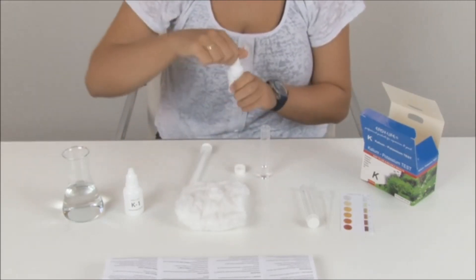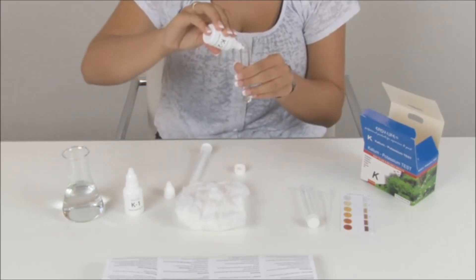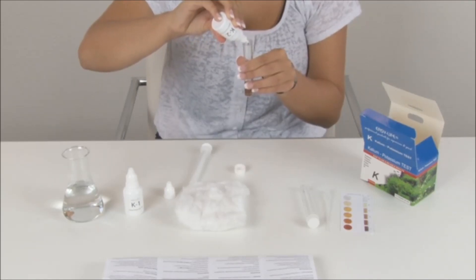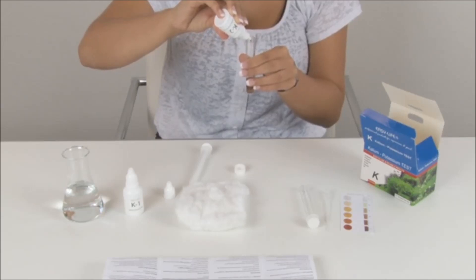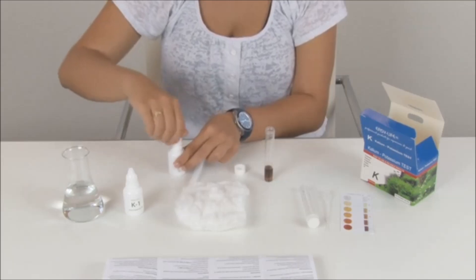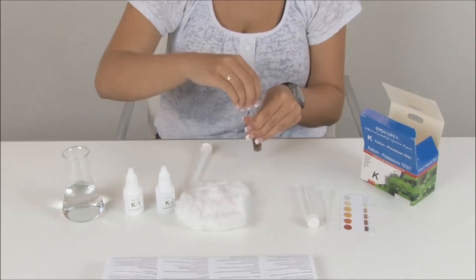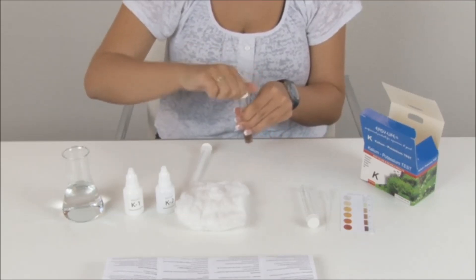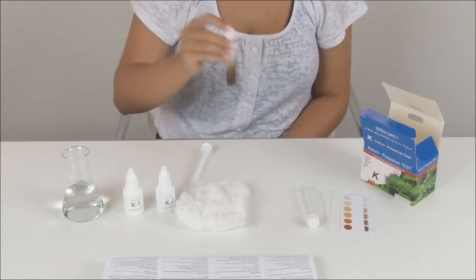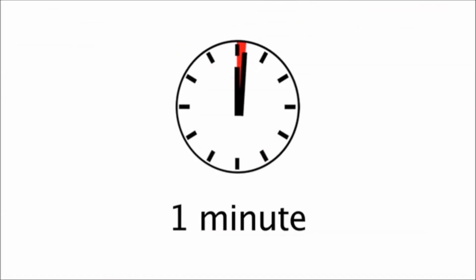Shake first, then add 10 drops of reagent K2 under a 45 degree angle. Cap the test tube and shake it a few times. Wait for 1 minute before proceeding.